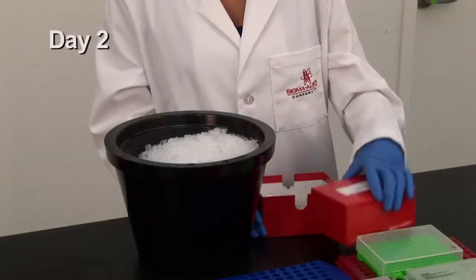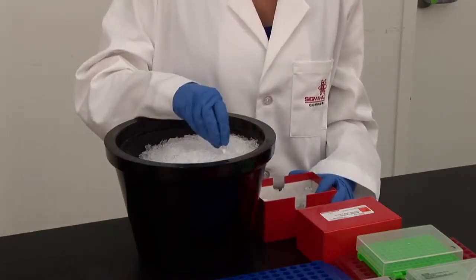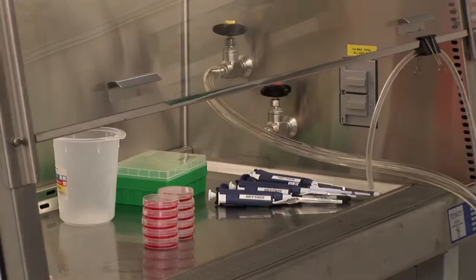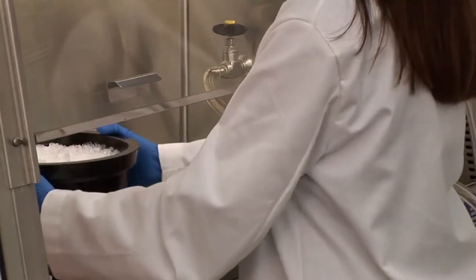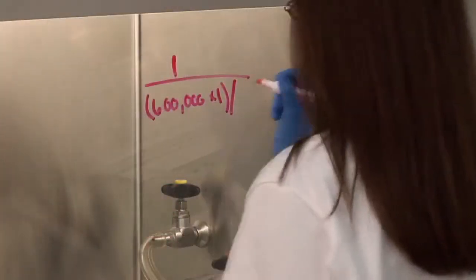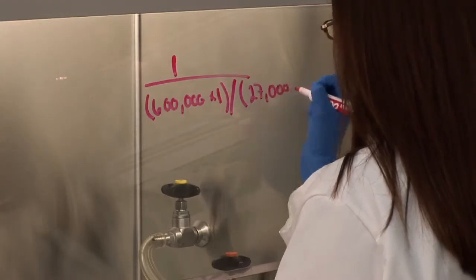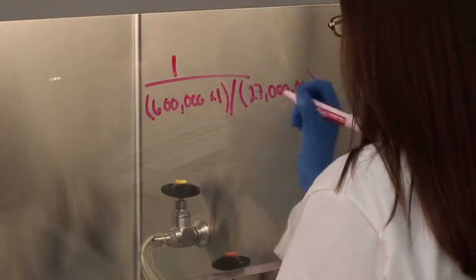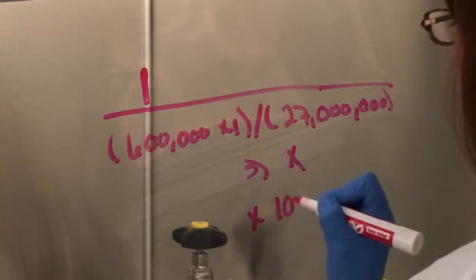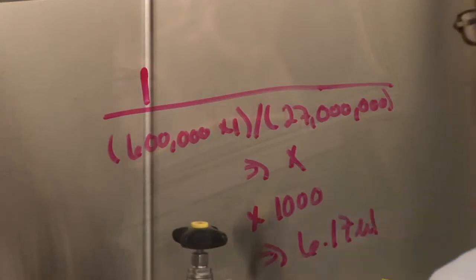To prepare for transduction of cells with the Mission Lentiplex pooled shRNA library, thaw the lentiviral particles on ice. Transfer the thawed particles to a laminar flow hood, keeping on ice if not being used immediately. Calculate how much of each individual viral subpool to add to the cells to get a multiplicity of infection, or MOI, of 1 across all cell culture dishes. A low MOI is used to reduce the probability of multiple integrants per cell.